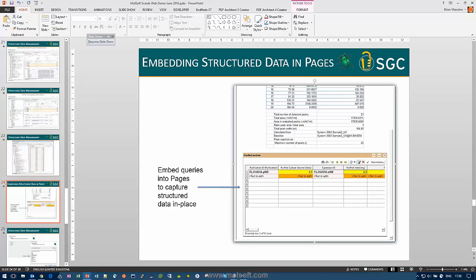So this is useful in templates, for example, where you may be capturing the protein purification prep, where you've got to capture gel images, chromatography images, maybe mass spec spectra, or whatever, and you also got to capture the metadata about how much was made, or when or where, with which columns, and so on and so forth. So when you save the page, it saves the structured information into the back-end database as well as to the page itself. So you killed two birds with one stone.